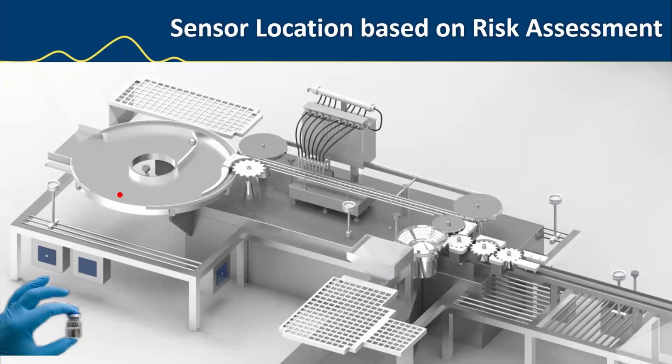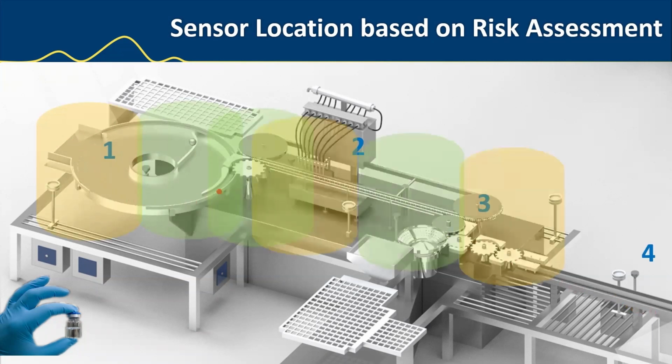So looking at the implementation of traditional methods, we take a filling line, for example, and follow the path of the vial. It comes out of the sterilization oven, so we have an open vial, goes into the accumulator here, and then it'll find its way to the fill line, onto the fill head, and then onto the stopper and capping stages of the process. At each stage you want to be monitoring, traditionally with particle counters, air samplers and settle plates in these areas, so you have enough coverage as the exposed vial goes through its process in the filling machine.